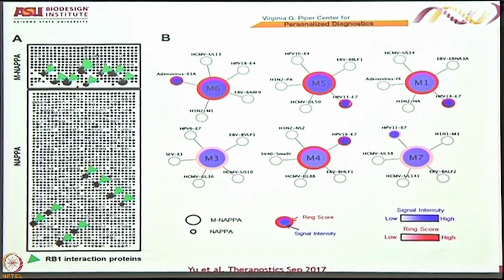Here's another one, and probably that protein is responsible for that. Here's one that was kind of weak, and notice that we don't see any of these 5 spots lighting up. So that becomes a little bit of a question mark. What would you call that, thinking back to our statistics from yesterday? It's a possible false positive, right? The mix spot says there's a spot there, but when we went to confirm it, we couldn't find it. So that might be a false positive. We don't know. It could be that we just didn't get good detection here.